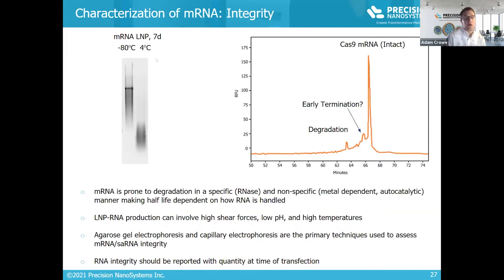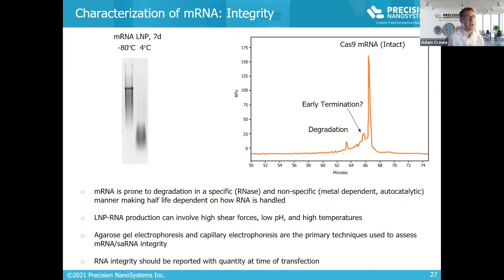There are a few ways to assess SARNA integrity. The two major approaches are gel electrophoresis and capillary electrophoresis. A gel of an LNP sample kept at minus 80 degrees versus 4 degrees after seven days shows an intact species at minus 80, but near-complete degradation at 4 degrees. With capillary electrophoresis — shown here with a Cas9 mRNA — you can see a large intact species, with tailing toward the front representing degraded species, and unique peaks corresponding to early termination events from the IVT reaction.